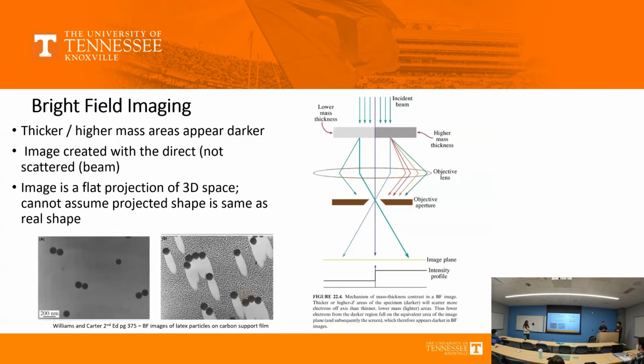Also, I did read some papers. There are certain cases where precipitates or microstructural features were observed in bright field, but their diffraction spots were not seen, whether because they were early in the nucleation process or at a very low volume fraction. So while bright field may be perceived as a somewhat simple or elementary imaging technique, if you're looking closely you can catch things with it that you may miss with some of the other techniques.